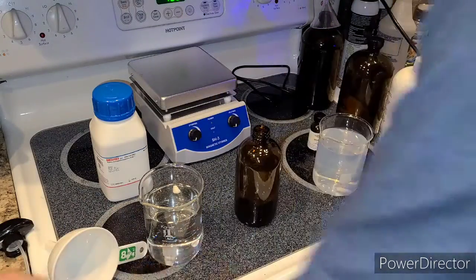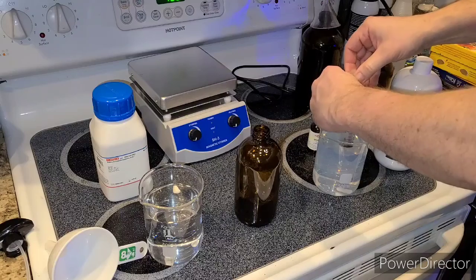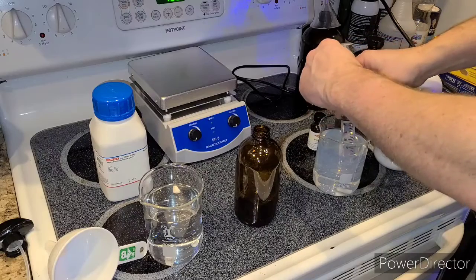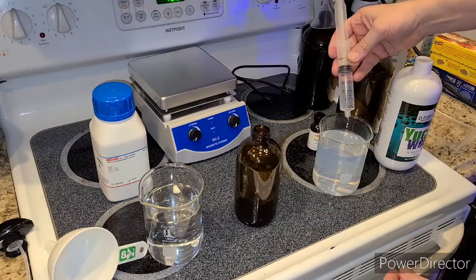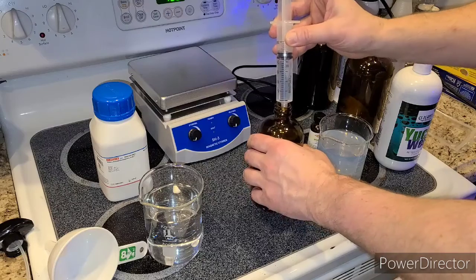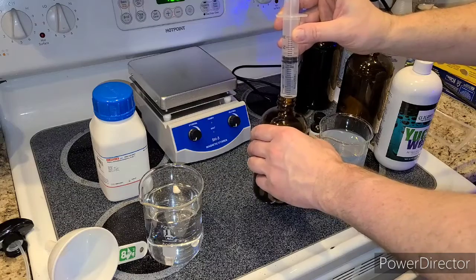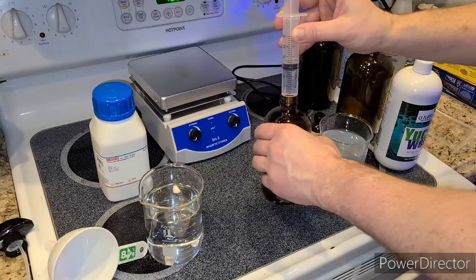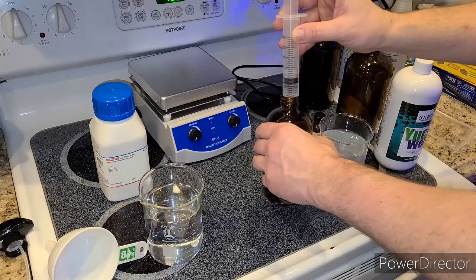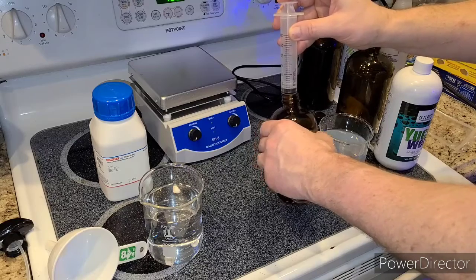Then I'm going to take the same amount of the silver nitrate solution — 23 milliliters — and add it while mixing. I'll start putting it in and mixing at the same time, switching them around while mixing it in, trying to get it done within 10-15 seconds. Mixing these up — the sodium thiosulfate goes first, and then the silver gets added to that. And now I've got these two mixed.